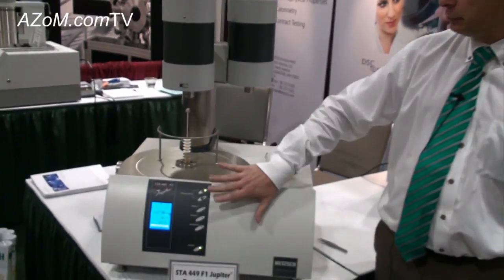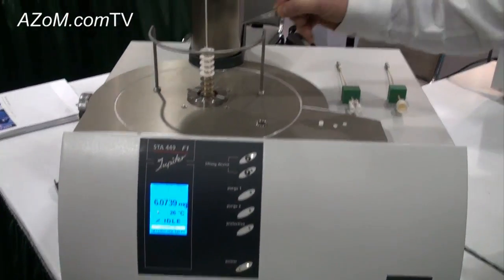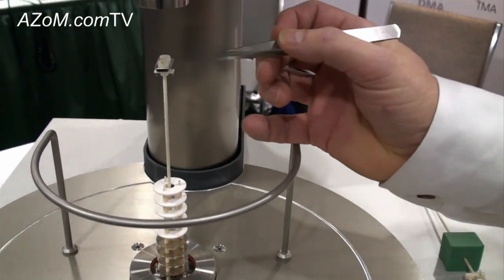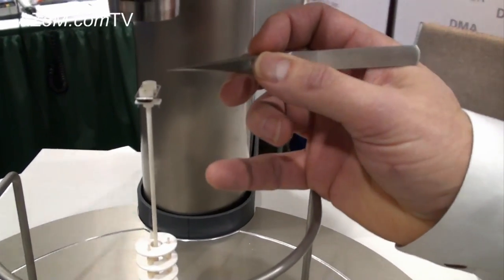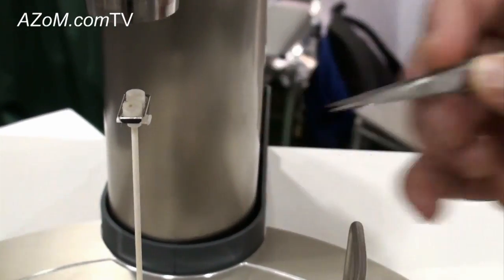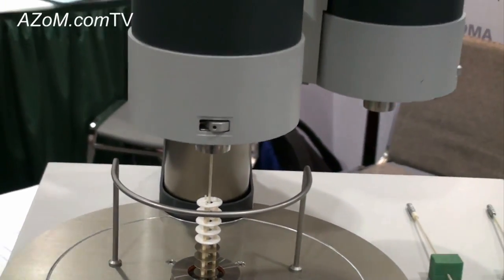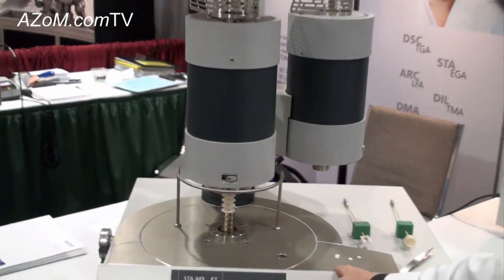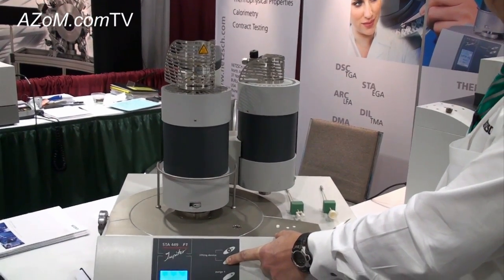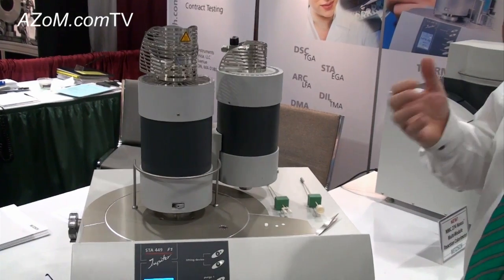The design of the system is we have a balance down below and then we have a sample carrier on which we have a heat flux DSC sensor. To make the measurements we typically have an empty reference pan and then a pan with our sample, and then we close the furnace. We typically measure over a controlled temperature ramp, isothermal conditions, or a combination of ramps and holds.